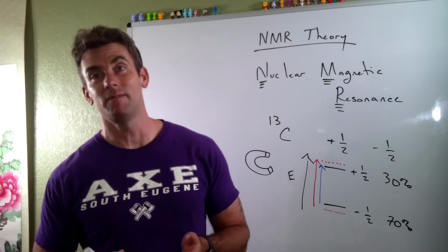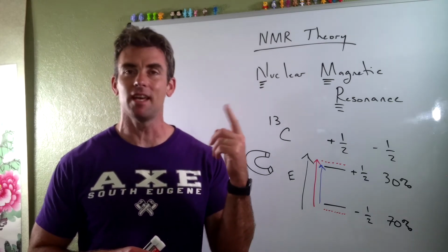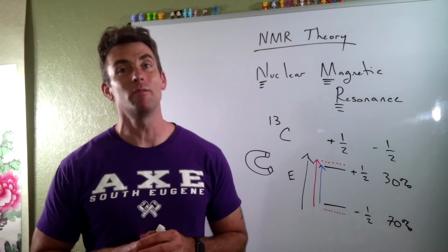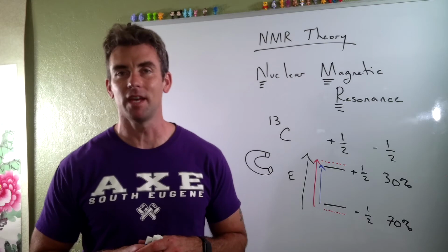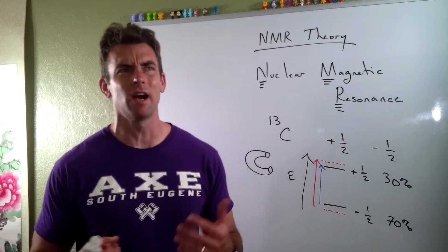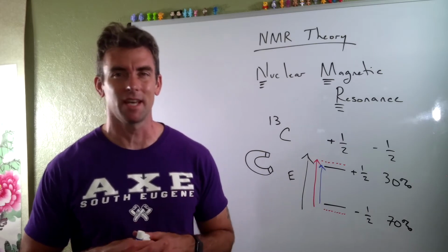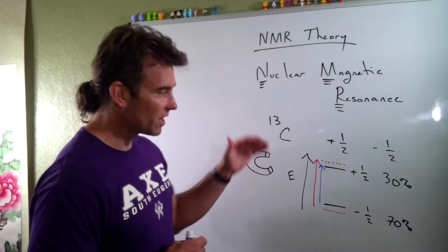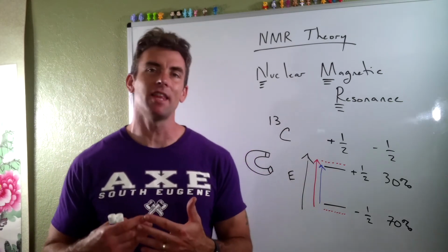Those of you that have had physics, this actually happens, that change in spin state happens in the radio frequency range, which is not a very energetic kind of thing. It turns out electrons also will do this, but we don't usually use electron spin resonance very often in chemistry. That's more of a physics thing. But that's what gives rise to the position on that scale.